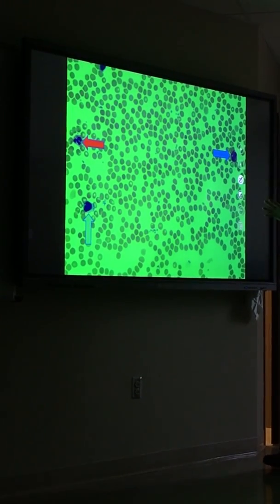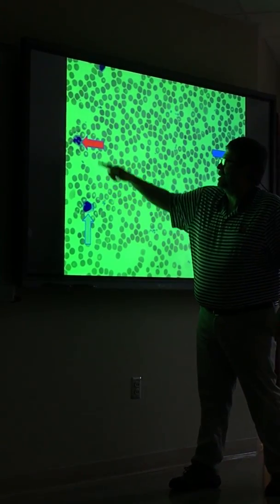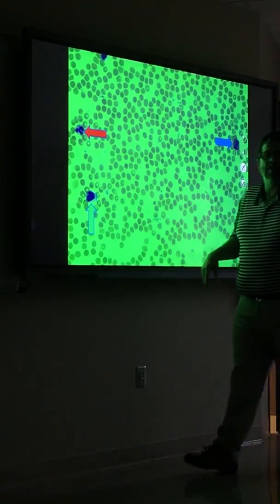Now, here's kind of an evil one. This, I believe, is a small monocyte. But look how much bigger it is than the neutrophil, right? Neutrophils never change shape. They're always very similar. So that's a monocyte. You can see the butterbean-shaped nucleus going there too.